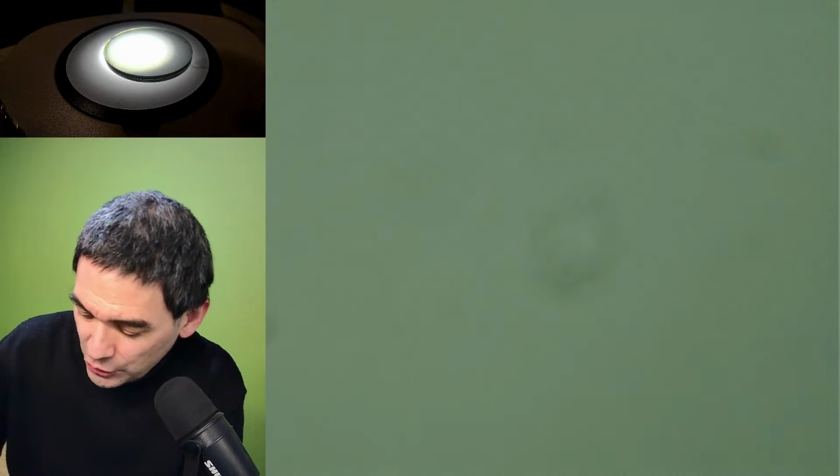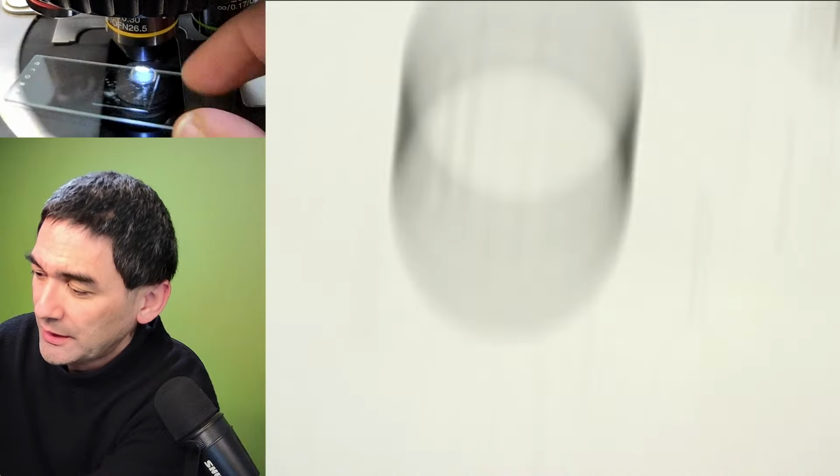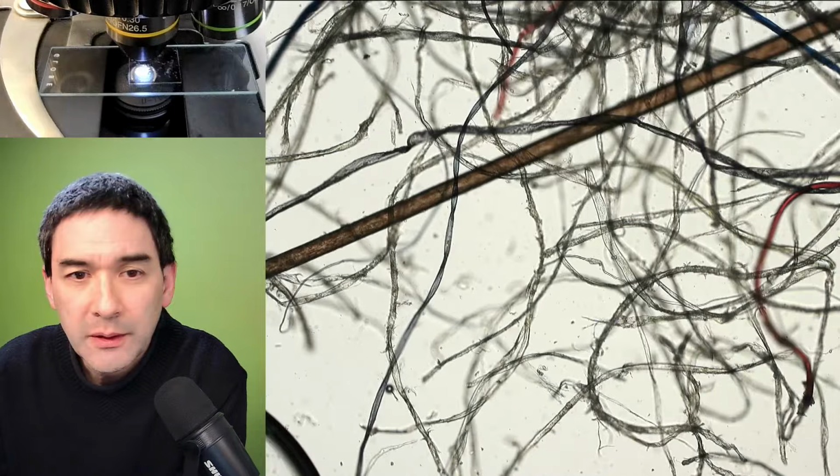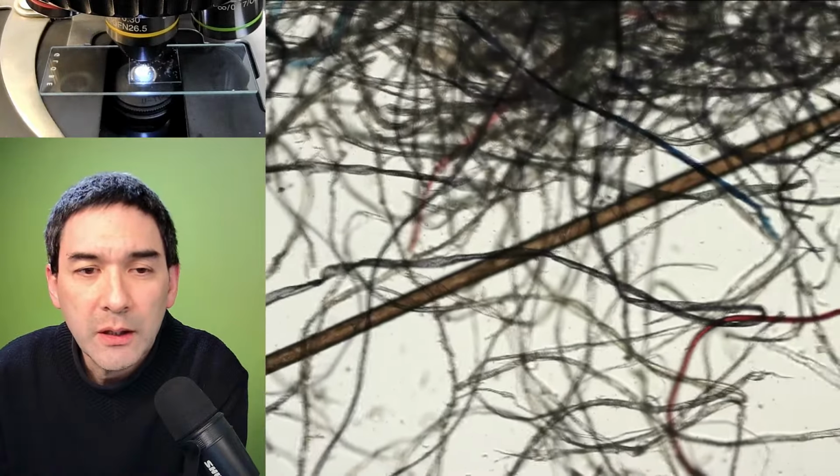Okay, so as a little short intro, I just wanted to show that to you. Let me quickly put this back here. Okay, wipe it off. Let's switch over again to the other microscope, and here we are again. We can also try to have a look here.